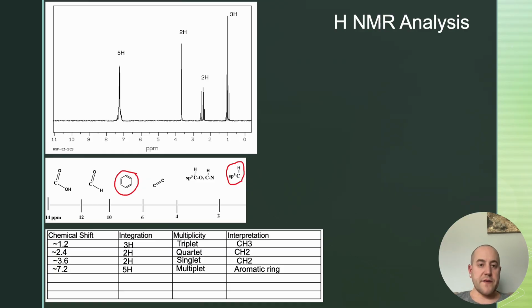The final graph we are given is the HNMR analysis for the hydrogen bond analysis. The top graph here is the one given for our compound. You can see 4 distinct peaks, each with peaks off to their sides. Down in the middle is the key we're given to show which functional groups could be in the peaks' areas. The graph below shows the chemical shifts, the integration, the multiplicity, and the interpretation of which structure could be found along the way.